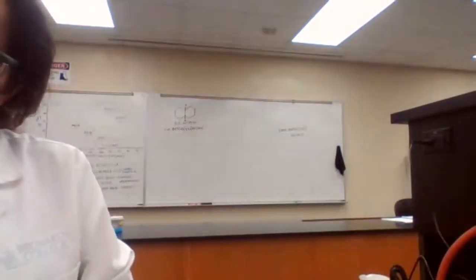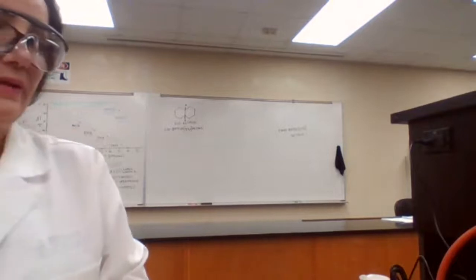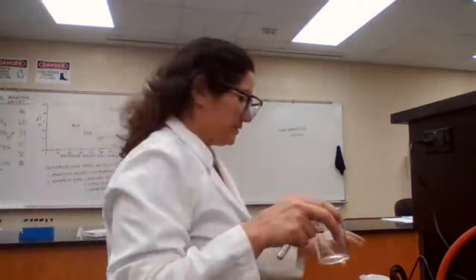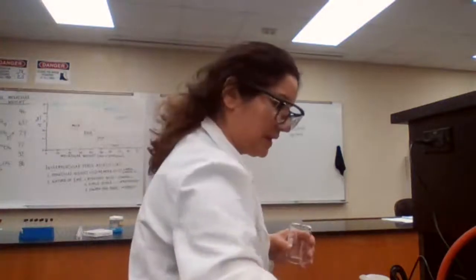Then we have the mass of the stoppered iodine. So I'm going to take this out.